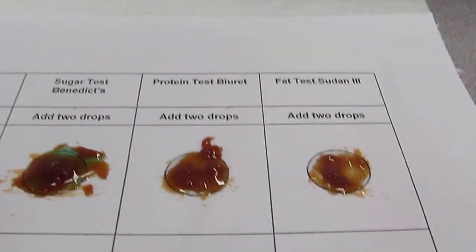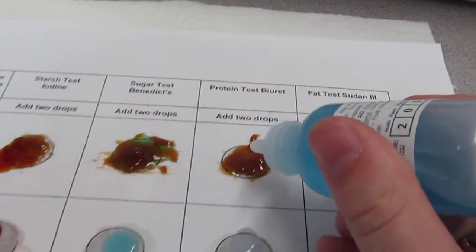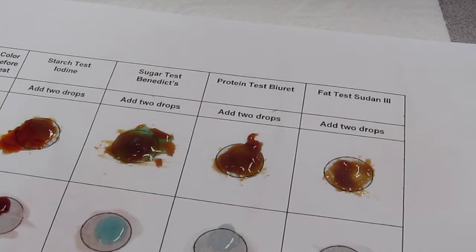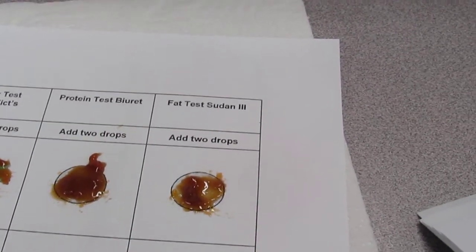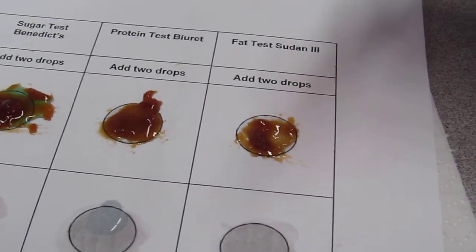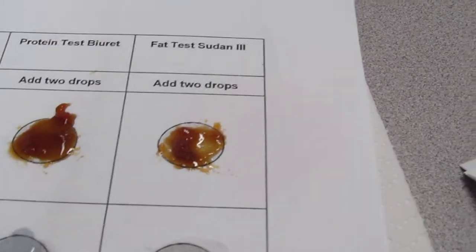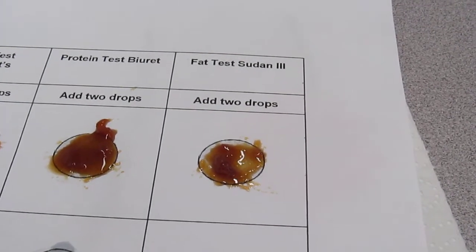And then you've got the Biuret, and what are you testing for with Biuret? The proteins. I think it might have some protein. Brian, can you finish this one? It looks kind of yellowish. Yellowish, so that means it didn't change. You should use it like one of these. He's going to put a little bit.